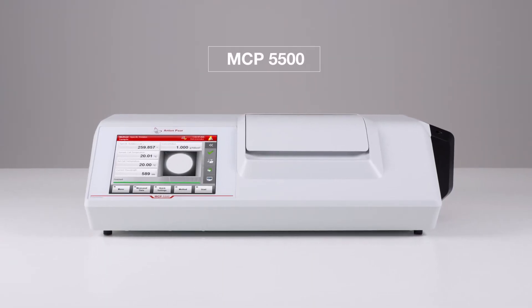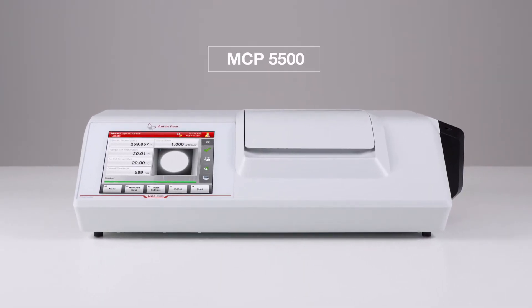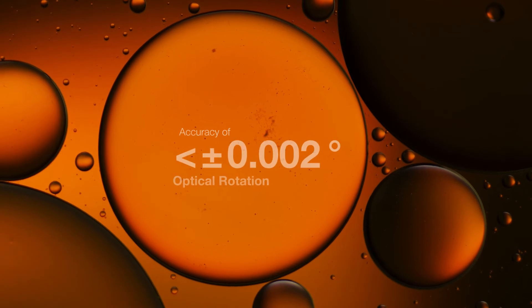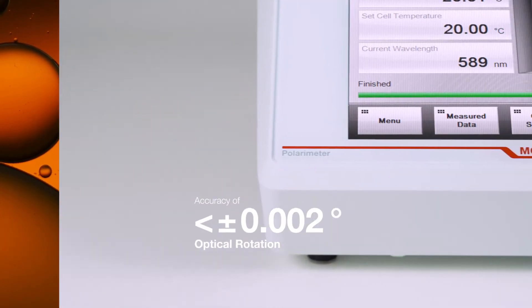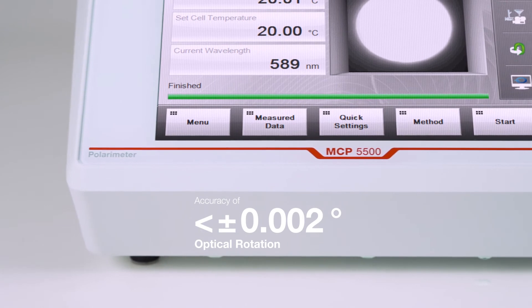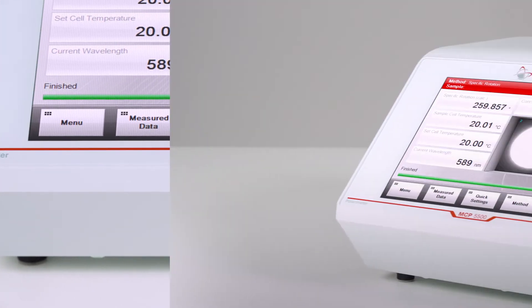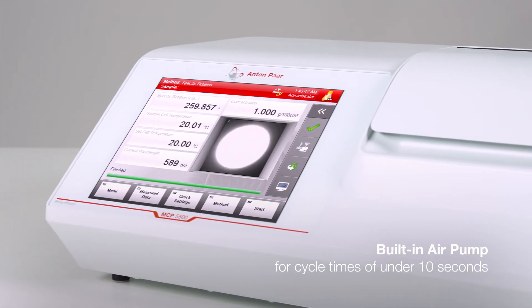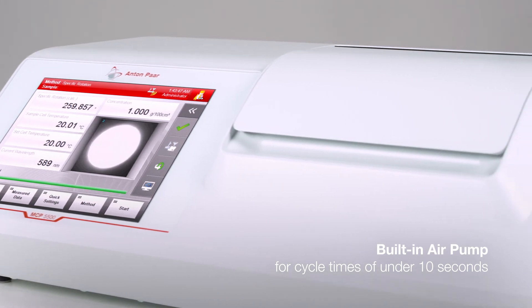Measurement heavyweight MCP 5500 spots the smallest impurities and material changes, delivering supreme accuracy across the full measurement range. The built-in air pump dries cells to further reduce cycle times to under 10 seconds.